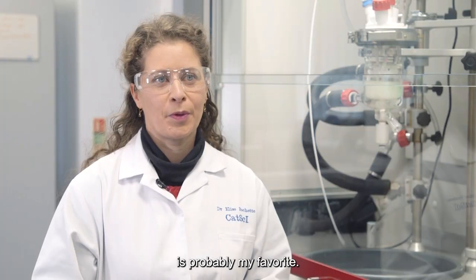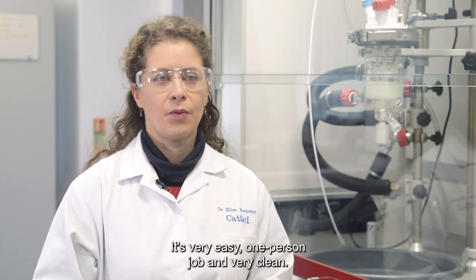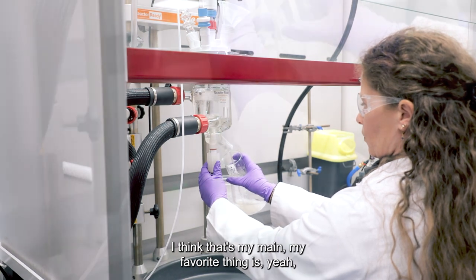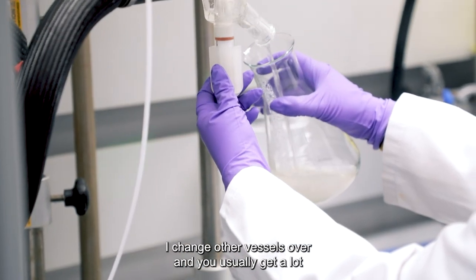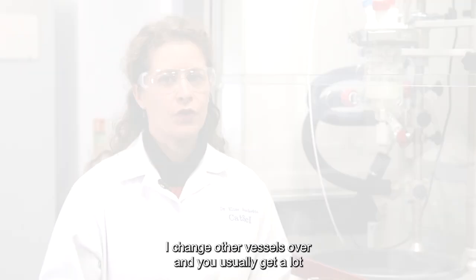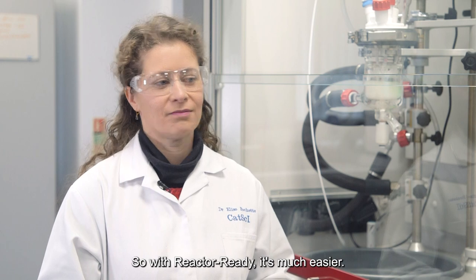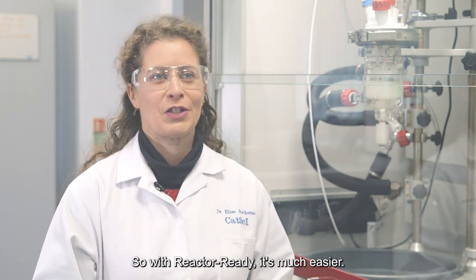Changing the vessel is probably my favorite. It's very easy, one person job and very clean. I think that's my favorite thing. With other vessels you usually get a lot of oil spill which is not very fun to clean, so with Reactor Ready it's much easier.